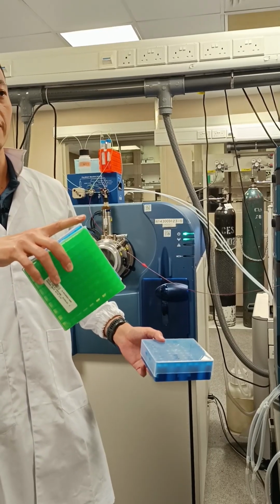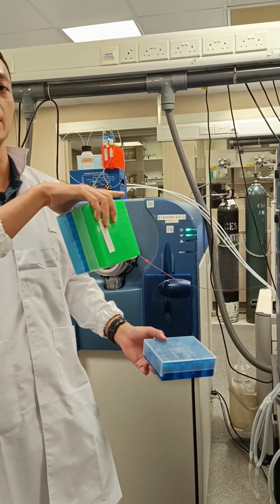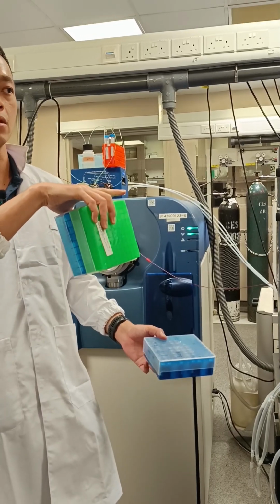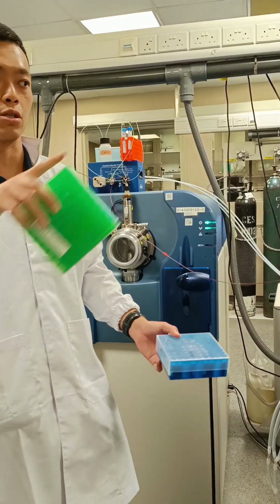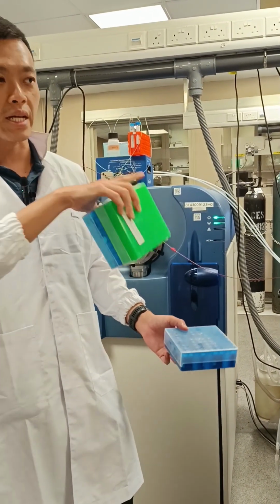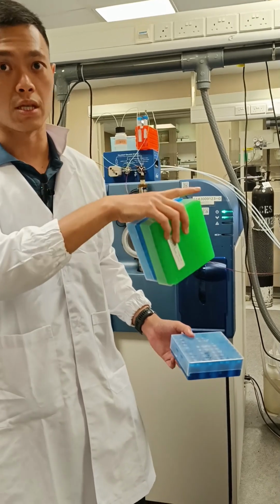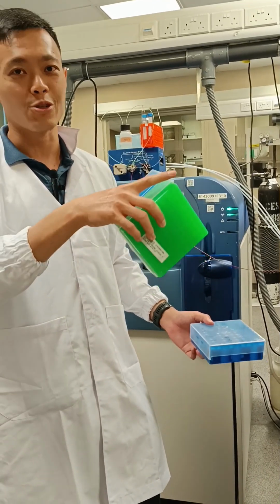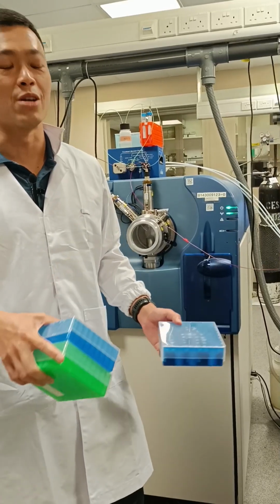So if I don't come here on Wednesday morning to flush the system, I will just come on Friday. It depends. For example, next week, because Sheila told me that she's coming to use it on Wednesday, I will have to come on Wednesday morning to flush the system so that she can use it. If there's no one else going to use it, then I'll just keep it until Friday. So that's the current practice.